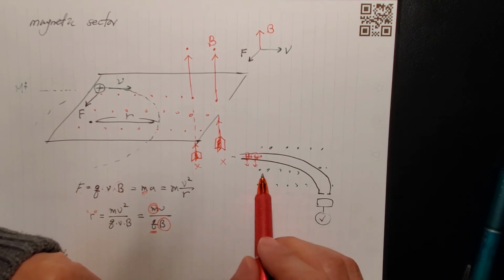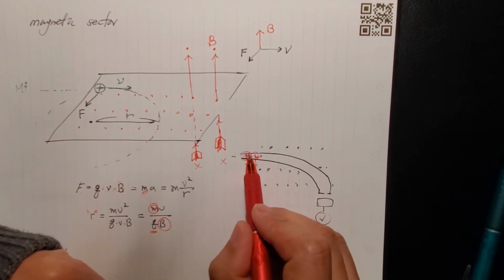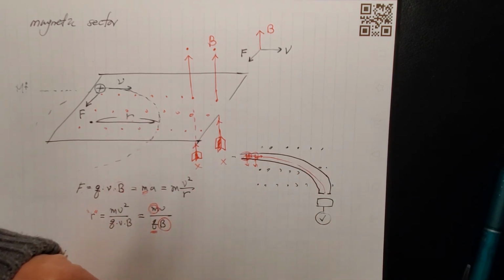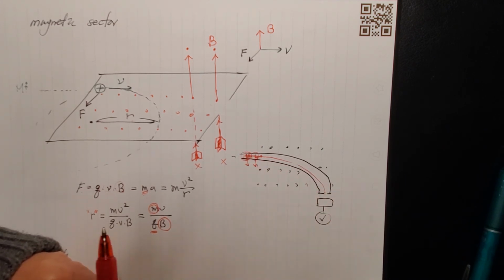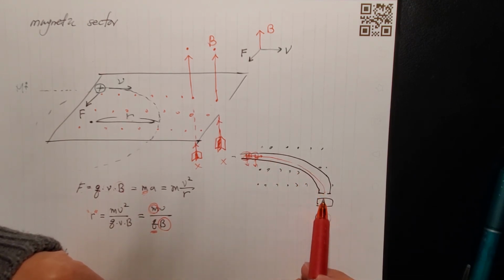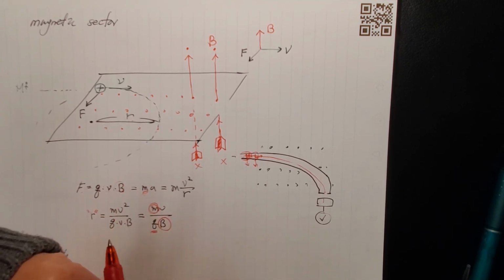So say the magnetic field given is just enough strength to have the heavy one curve with the radius proper and the same as this magnetic sector, then it's going to curve just right and enter the detector. The machine knows at the time something was detected the amount of magnetic field given, and it can calculate the mass.